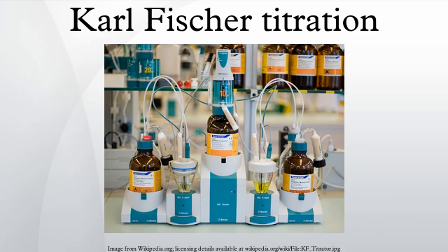Karl Fischer titration is a classic titration method in analytical chemistry that uses coulometric or volumetric titration to determine trace amounts of water in a sample. It was invented in 1935 by the German chemist Karl Fischer.